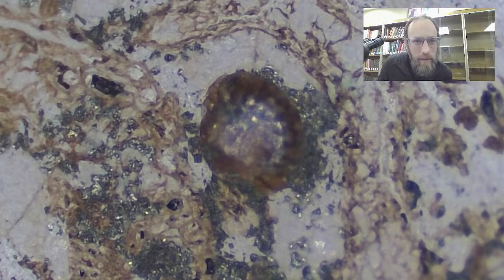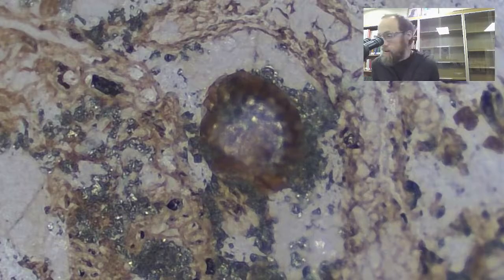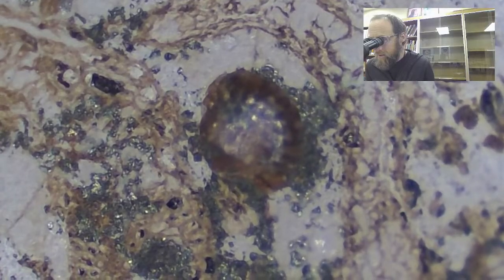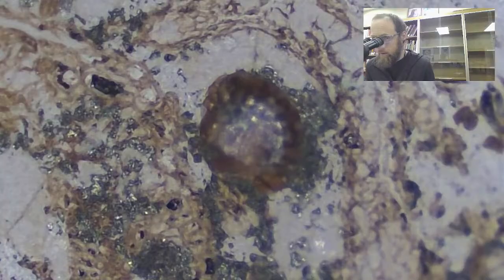I'm kind of thinking, because we're looking at fern material, and I've seen another one of these before, it could be kind of just the inner whorl of a fern part or something like that, something that's yet to unfurl itself.